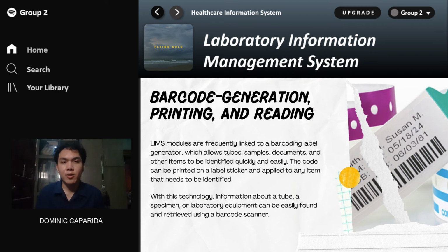Just an addition for this barcode generation, printing, and reading. Just before you get admitted to a hospital, the hospital has barcode generating machines where they can print barcodes, and other hospitals also print QR codes. This barcode will be put on the patient's wrist for the purpose of identification. They also have a barcode scanner, where if they scan this barcode on the patient's wrist, they will automatically identify the personal information of that person.